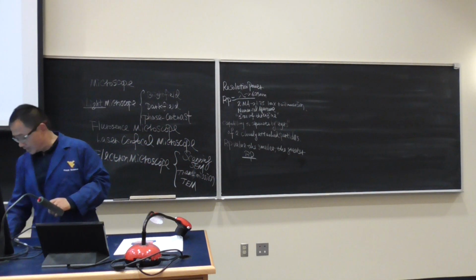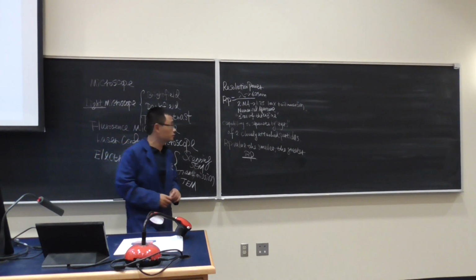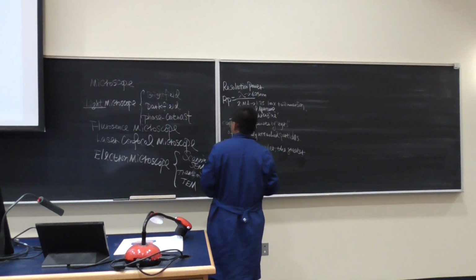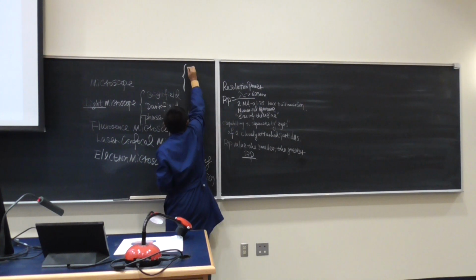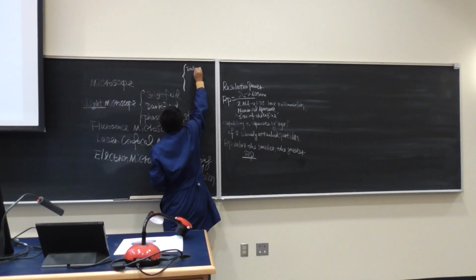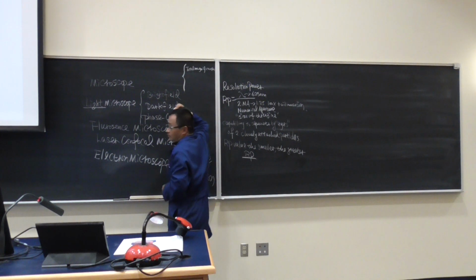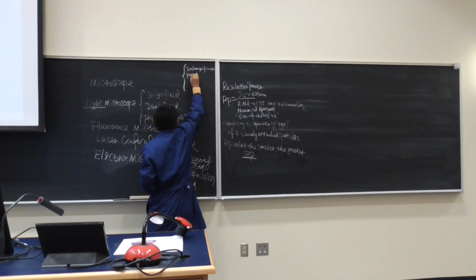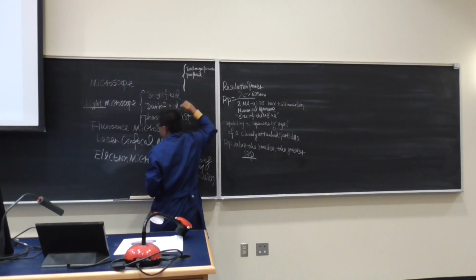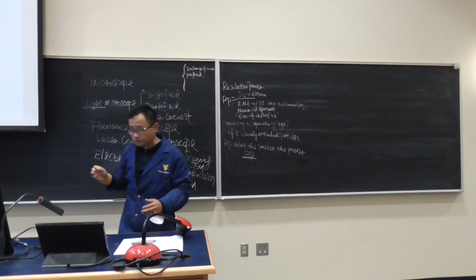So as usual, we already talked about the bright field microscope and all this terminology, and we're not going to repeat it here. I just wrote all these concepts we mentioned in the lab as a review for you. What is called total magnification? That is the ocular lens magnification multiplied by the objective lens magnification. And we talked about parfocal, which means once the lens is focused, it stays focused, and only a minimal adjustment is needed.